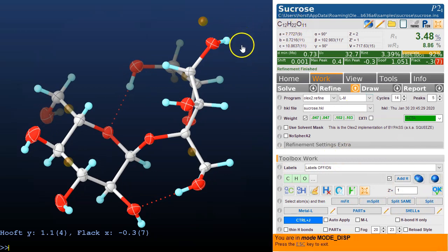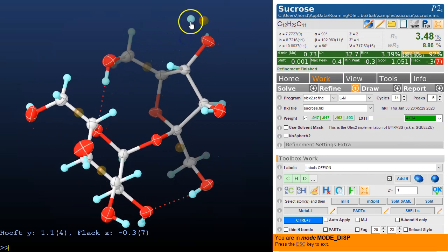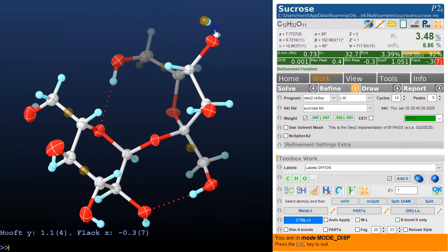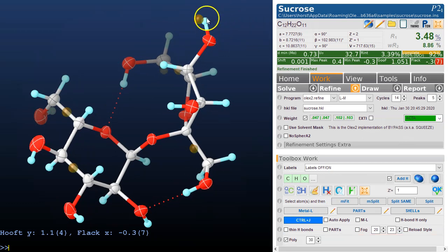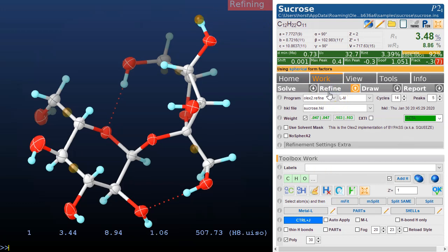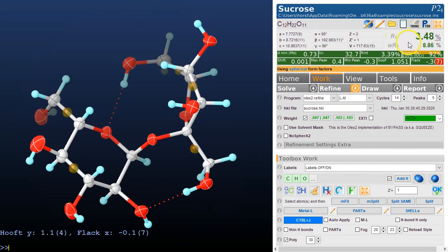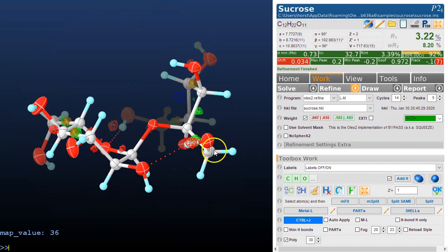If I now press the left mouse and the shift key, I can move this in this direction here. I'm not really cheating here, I'm just giving it a hand. It's going in the right place, it's still constrained where it was before. If you refine this, watch the R factor: 3.48 going down to 3.22.